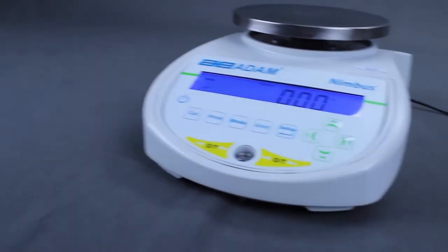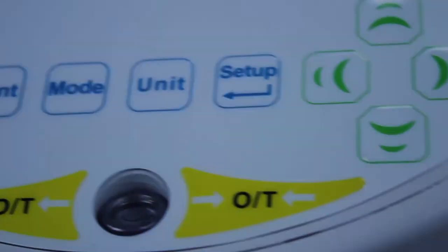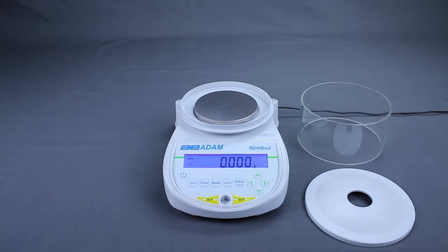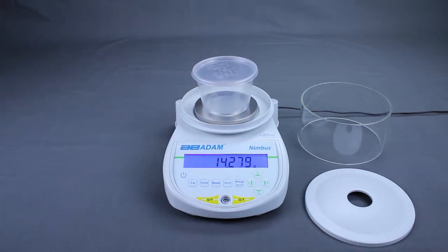The process can be started automatically when the subject is placed on the pan, or with a manual key press. Clear the weighing pan and make sure the display is at zero. Place a container on the pan as needed and tare the weight of the container.